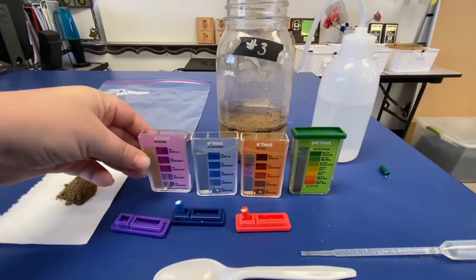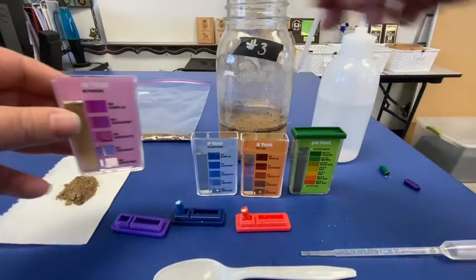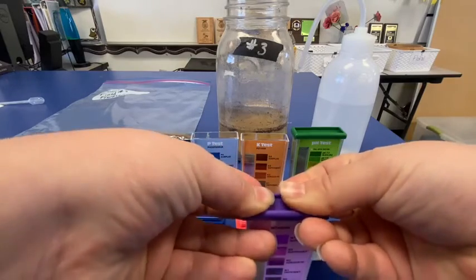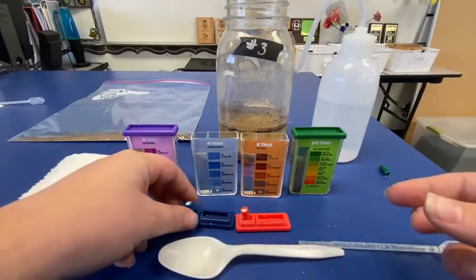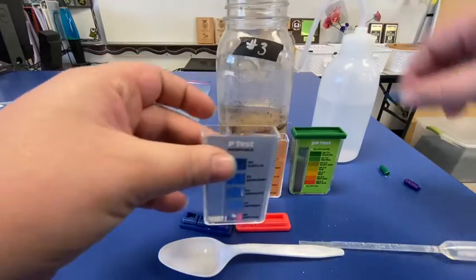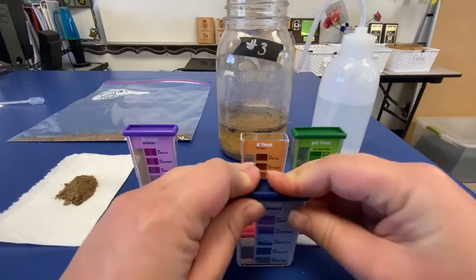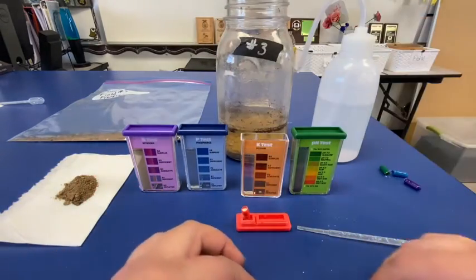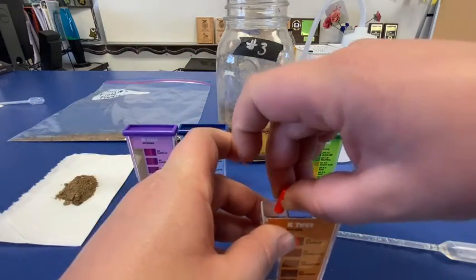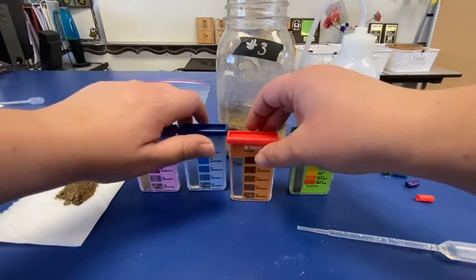I'm going to begin with nitrogen. I'm going to empty that capsule into nitrogen. Place it to the side. Cap our sensor. And I'm going to shake this once I've completed all of these. Taking phosphorus, placing it into the test chamber, capping it. I'm going to set it to the side so I can shake it afterwards, and finishing out with this K, potassium, or that potash. Capping it, and now I'm going to shake it for 1 minute.